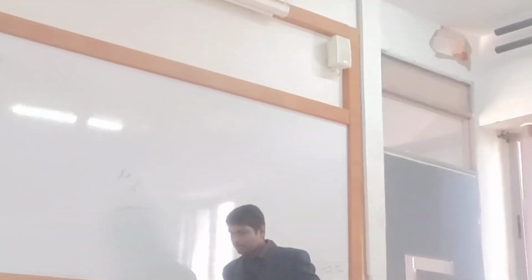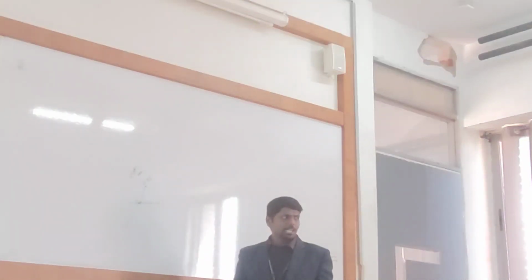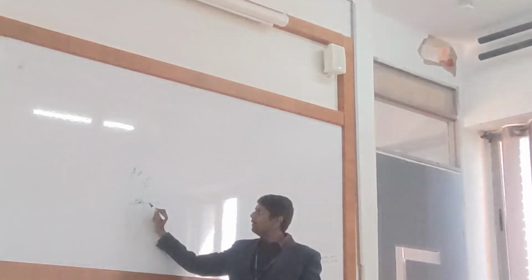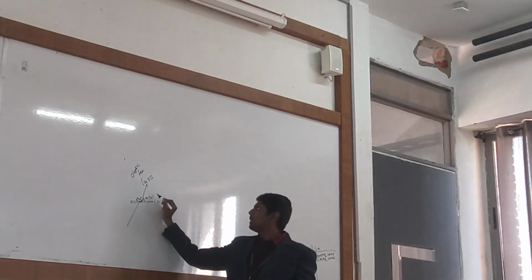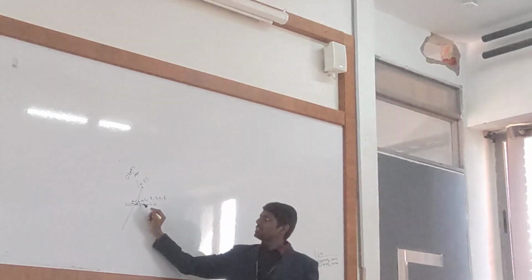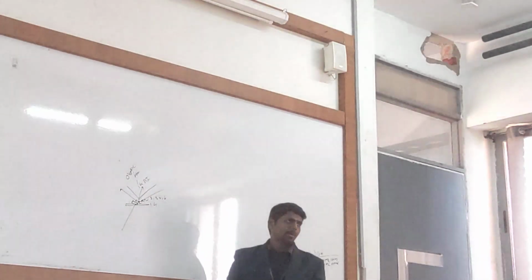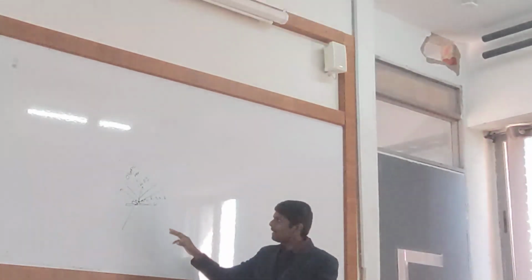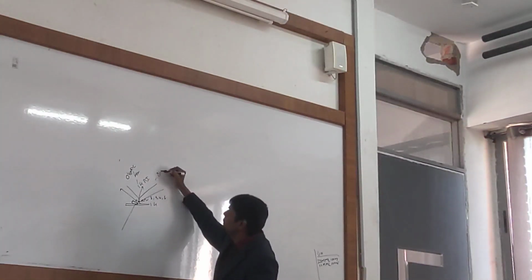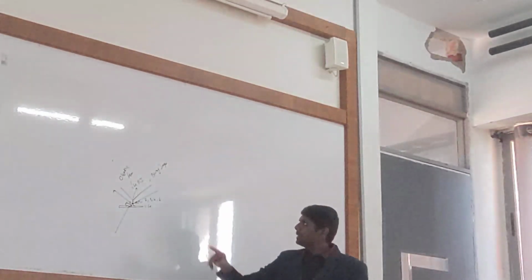Now let us see one problem. I have a transparent specimen. A transparent specimen has many elevations. Each elevation has its own refractive index, maybe 2, 3, 4, 6. Each elevation has its own bent light. Can I detect that bent light in a normal microscope? I cannot detect such light in a normal microscope. It results in a blurry image. Why am I getting a blurry image?